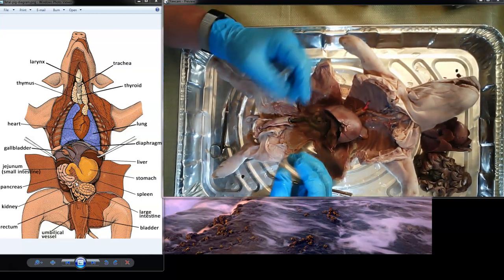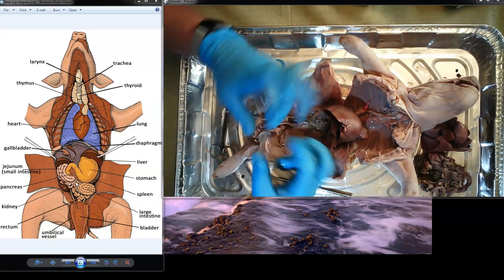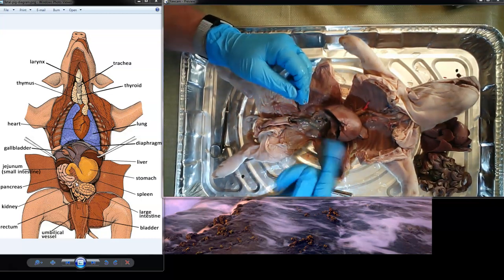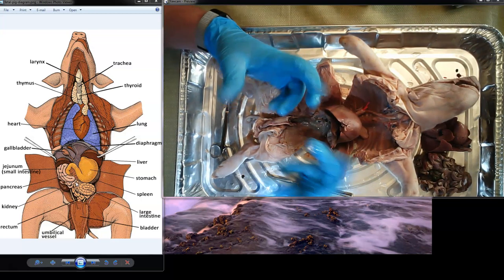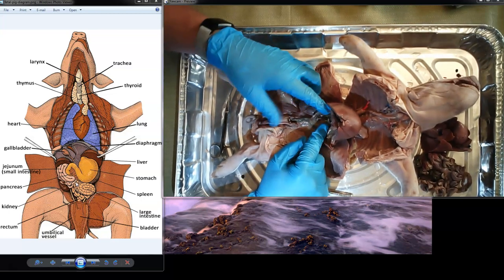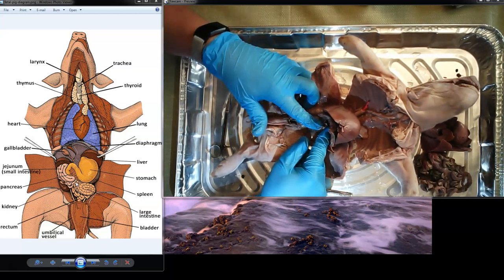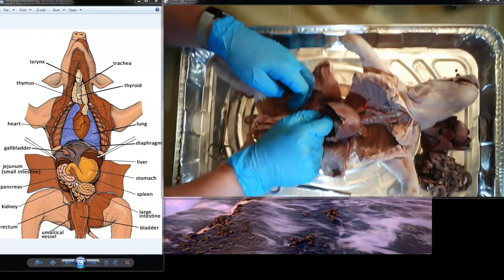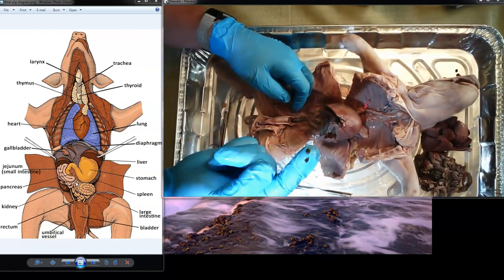It's sort of practicing opening and closing their lungs, and so they move things in and out. And sometimes some of the cells and some of the things inside the fluid inside the mother get inside the pig and they get inside the stomach, and it makes its way here. So this pig hasn't eaten anything, but it does have some feces, some waste in it. You can see, like I'm kind of picking it out. All right, so it's right there.